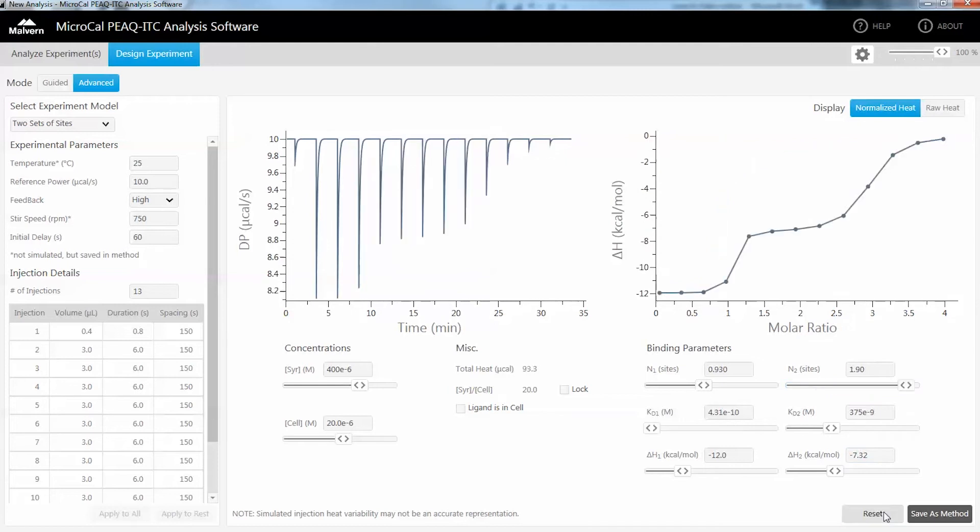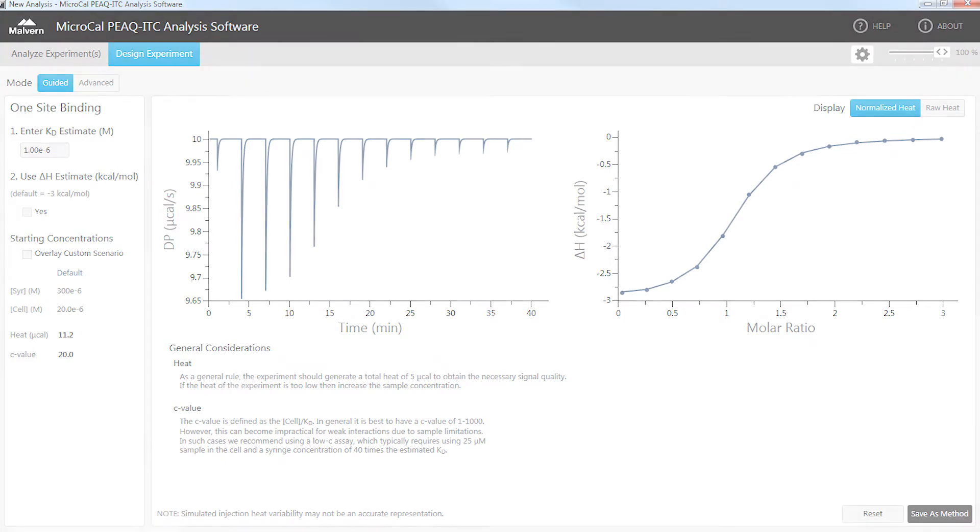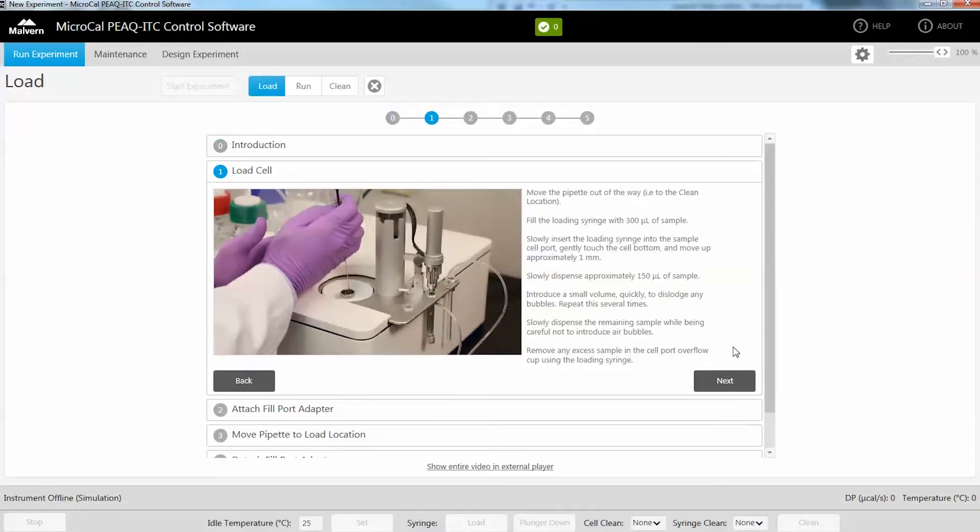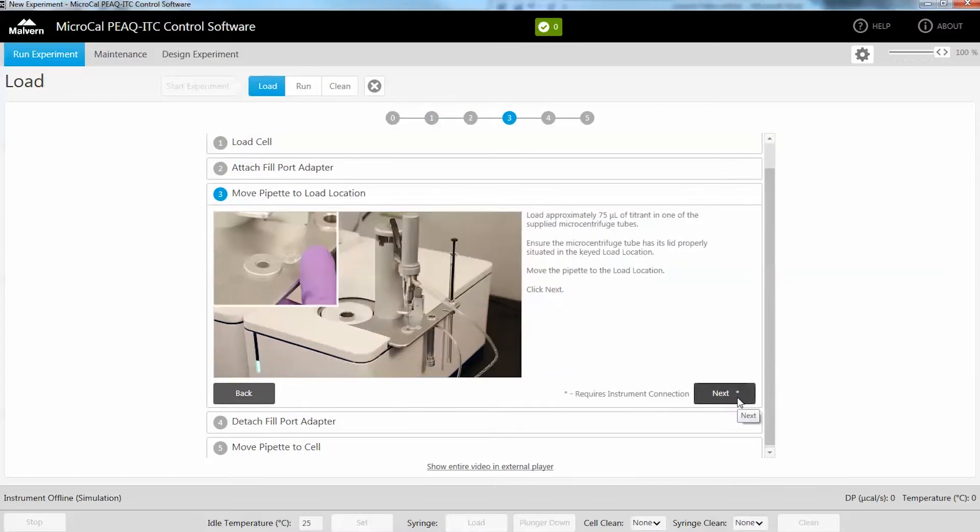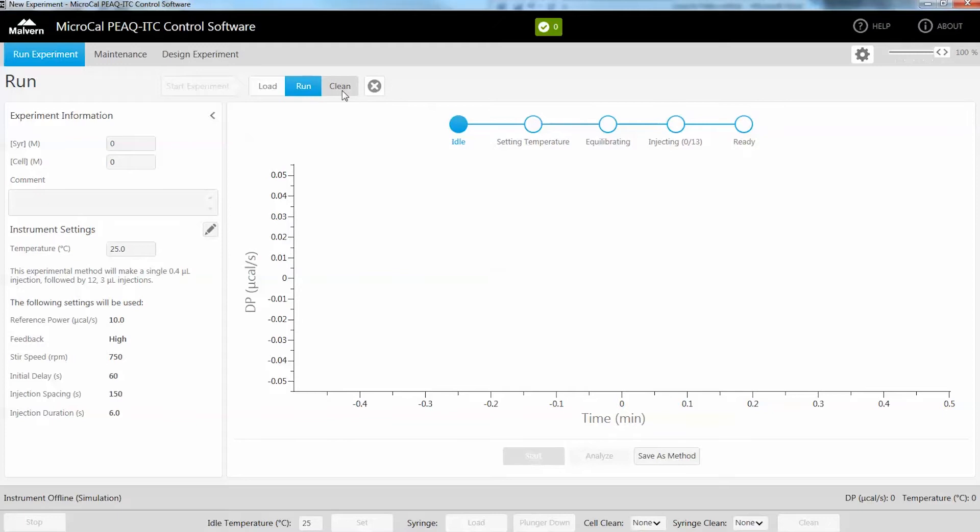For the less experienced user, the experimental design tool suggests run parameters and sample concentrations based on an estimate of the binding affinity. Once the concentrations and experiment setup are decided, you can follow the guided workflows showing you how to load the instrument. This is ideal for new or infrequent users.